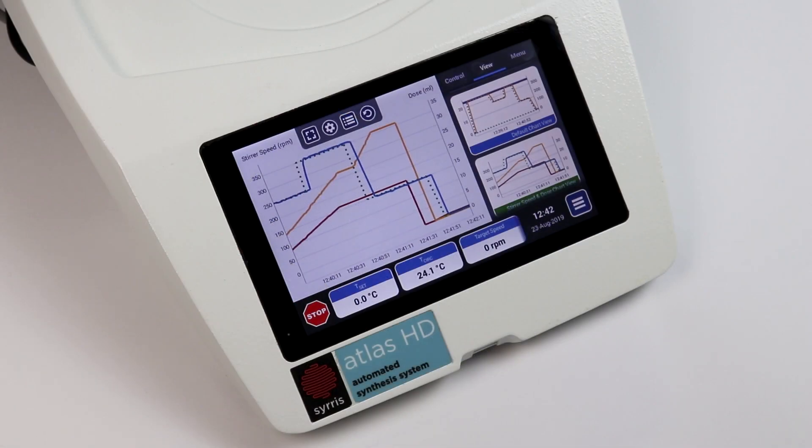All data is displayed graphically in real-time providing complete monitoring of reactions and processes via the graph tab, with all data stored in dedicated log files for easy analysis.